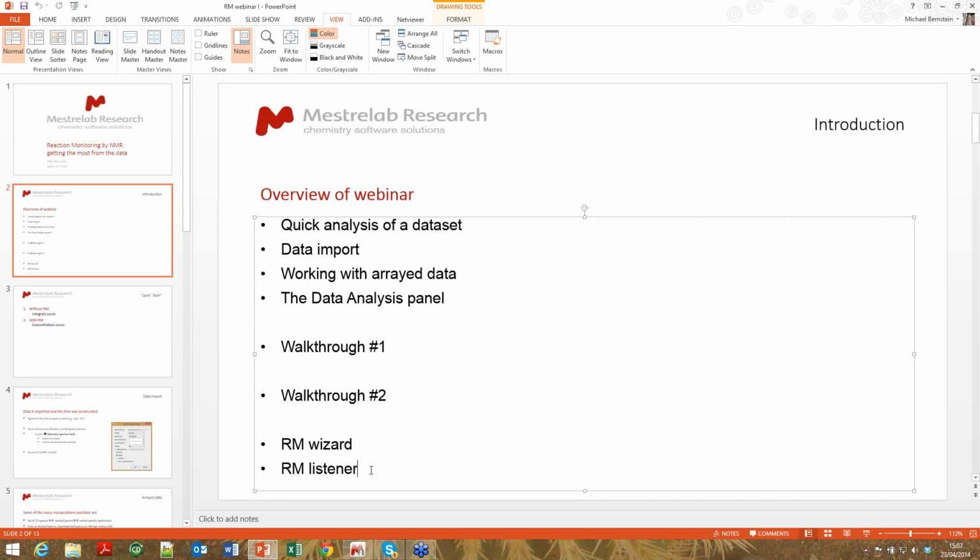So you're really building up classical kinetic data plots of concentration versus time, and there's a whole array of ways in which you can achieve that, and you'll see some of those today. I've got a few of my favorites which I tend to rely on, I'm afraid, but there is a lot of scope for ways to do it differently.